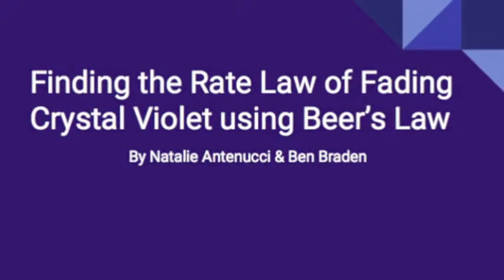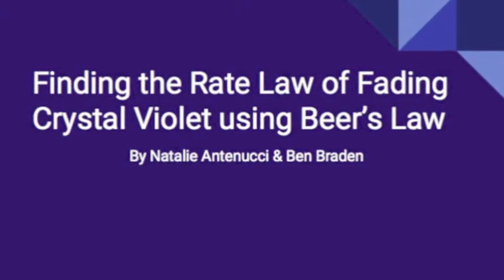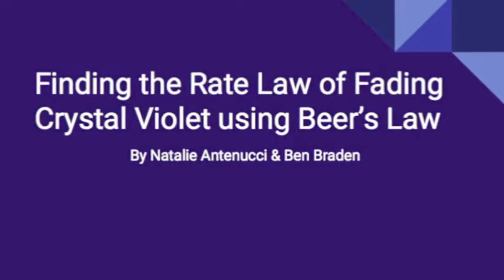This is the lab finding the rate law of crystal violet using Beer's law by Natalie Antenucci and Ben Braden.